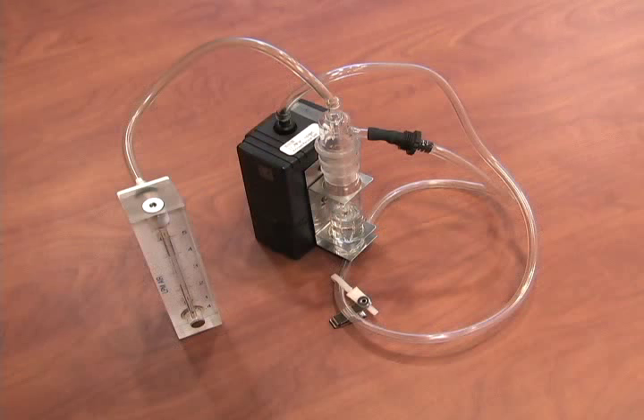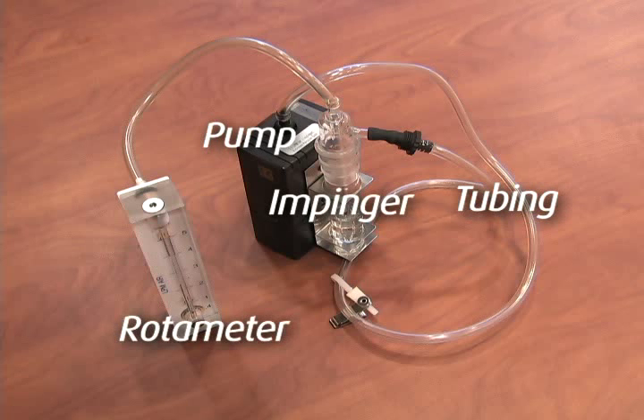Set up the pumps with the correct media in line, with the field rotometer as shown. The order of the components for calibration is: pump, tubing, impinger, and rotometer.